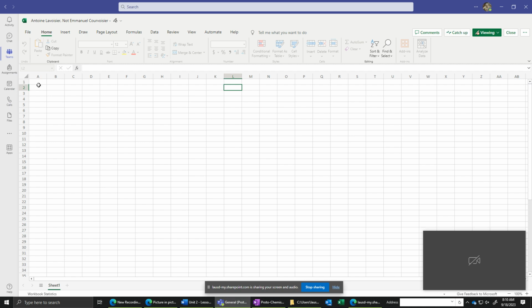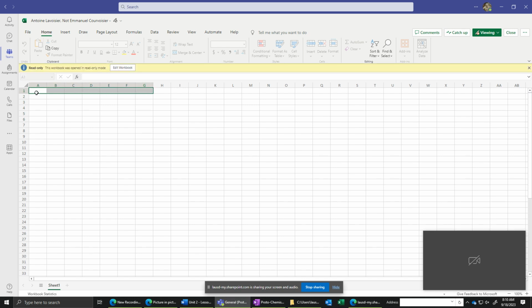But remember, when we do our data workbooks, when we start to put our data down, the first column is always trial numbers. So it's a description of what it is we're doing. Here, my goal is to have 4 or 5 trials of this, but we're probably not going to get that done. So we're going to do at least 2 trials, and then as a class we can combine the class data to come up with the additional trials here. There will be a handful of trials down here, but most likely it will be a little bit from each group, right?